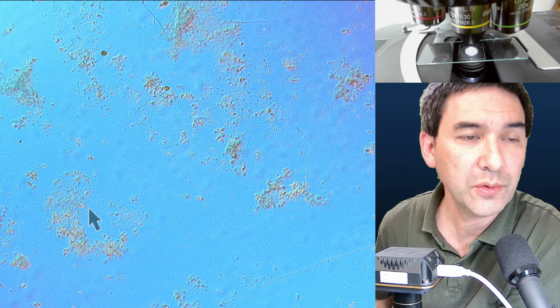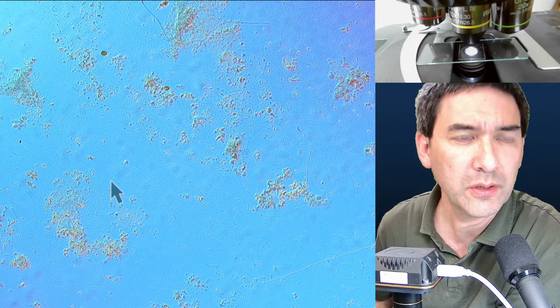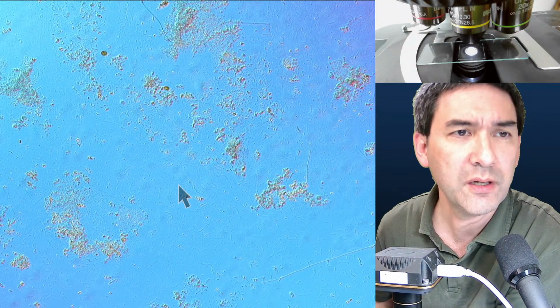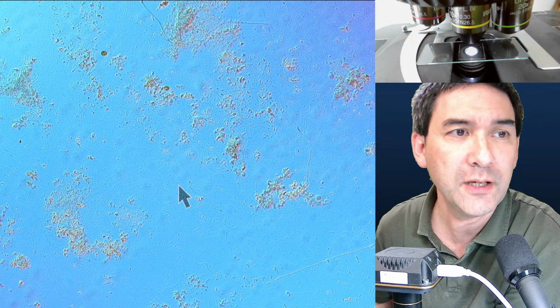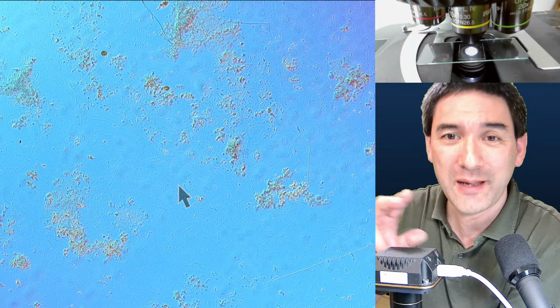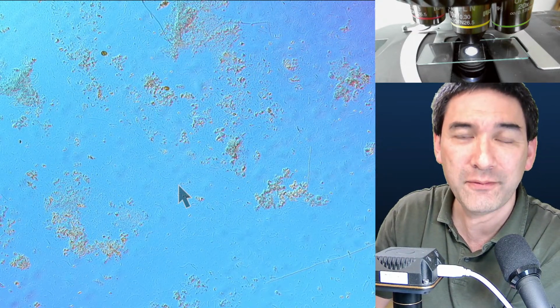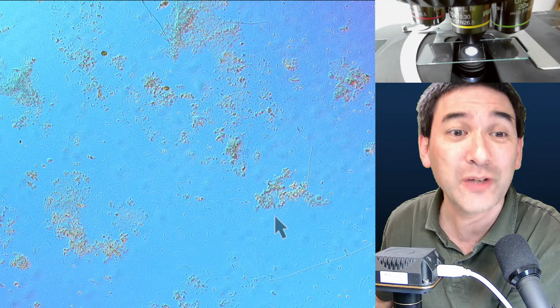Did you just see those microbes before? And now they are here. And here it looks actually much smaller. They look much smaller, actually much more difficult to see. Now, how is that? The objective has the same magnification. Well, this depends also on the field of view, because essentially my camera, the one over here, magnifies more than the camera that I have on the other microscope. So you see that magnification depends on a variety of factors.